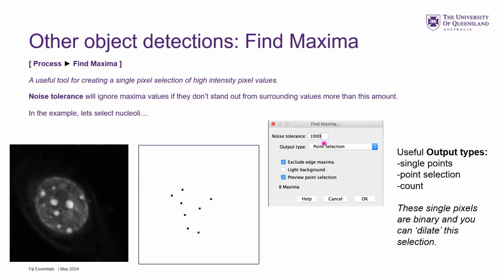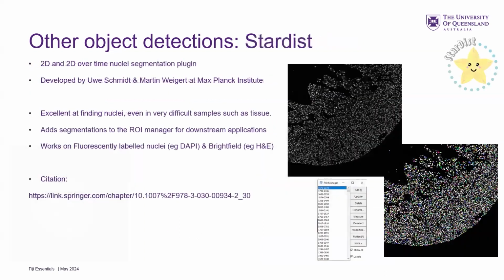So it can be somewhat useful, and you can output a single point or center of mass, or you can output things like the segmentation, which will be like a line between the minima. You can just say count objects. So if your things are really obvious as just particles or something, you could just use this and it will spit out to the table, I found 50 objects, analysis done. Again, you can use preview and it will show you. So it can be useful.